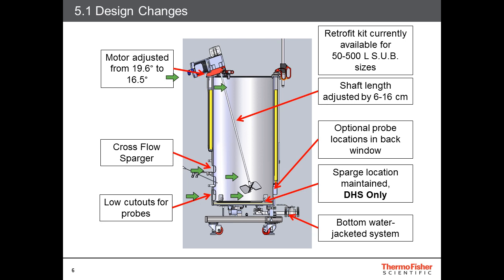So when we have to have the impeller well immersed at 20% of the bioreactor volume, it is important to make sure the length of the shaft is sufficient. At the same time, the shaft is not under any mechanical stresses due to its length. And the drilled hole sparger, as I mentioned earlier, is a type of film welded at the bottom of the bioreactor itself, and hence it doesn't pose any extra extensions into the bioreactor. It is right here at the bottom of the bioreactor itself.